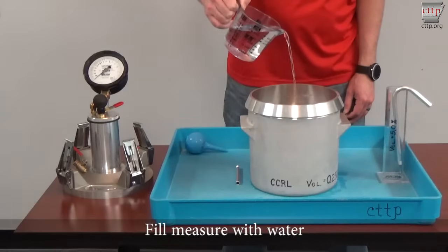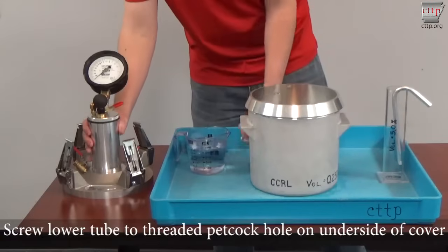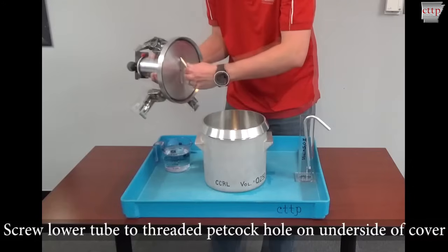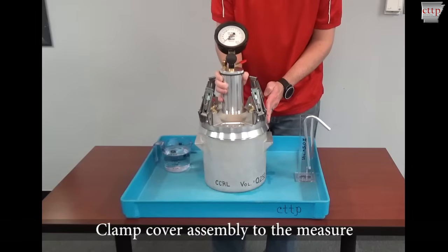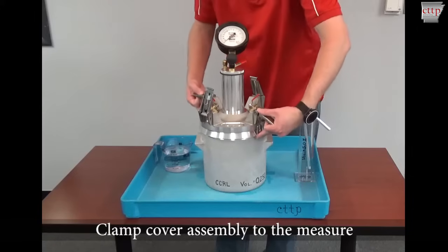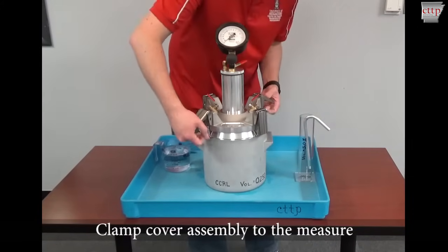There are two portions of this calibration, including a check of the initial pressure line and a check of the dial gauge reading. To verify the initial pressure mark, fill the measure with water. Screw the lower straight tube into the threaded petcock hole on the underside of the cover. Clamp the cover assembly to the measure, clamping opposite clamps at the same time. Ensure the clamp fingers are fully engaged under the flange to prevent leaks.